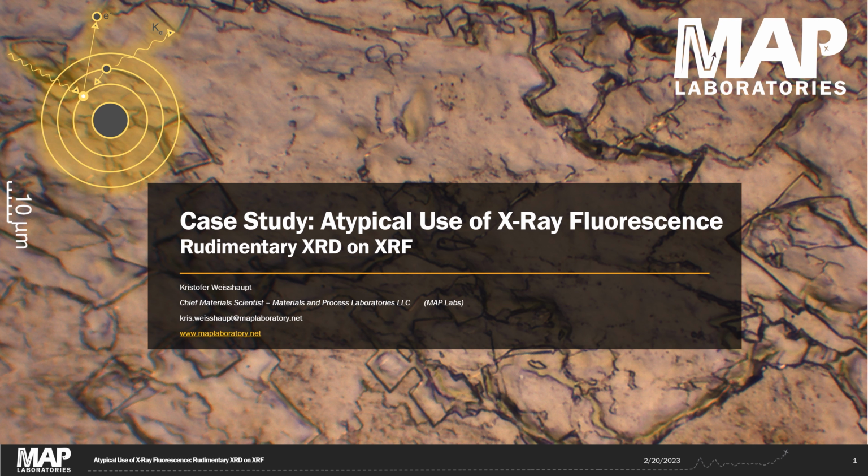A big part of what we do as materials scientists is help make the jobs of other engineers easier by providing insight, specialized testing, and optimization of various properties of the materials they're using. In this case, we'll be looking at an interesting use of X-ray fluorescence in which, instead of using the instrument for its typical application of measuring elemental composition, we instead used it to understand why some metal sheets were behaving differently when machining.